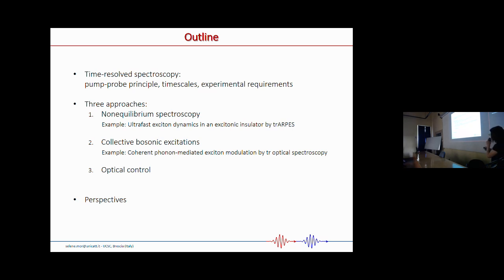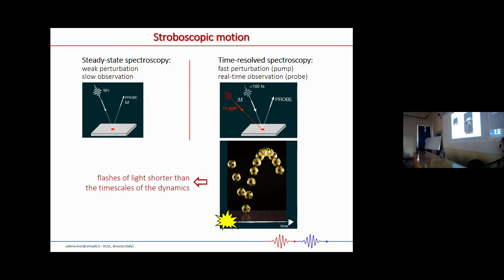And for the second part, the excitation and probing of collective excitations, I will focus on another recent work that we did together with Davide and Alejandro, where we use coherent optical phonon spectroscopy to investigate exciton dynamics in a layered semiconductor.